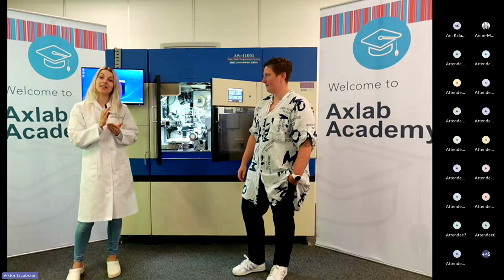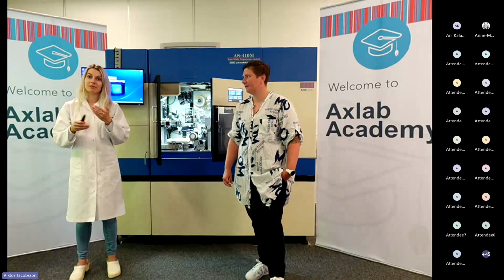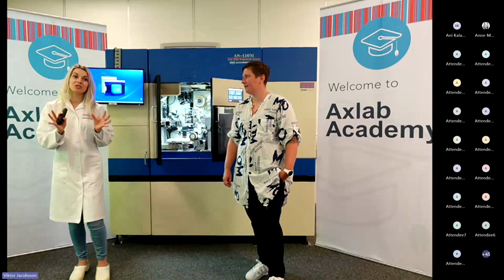Do you know when the system will be allowed to be used in the US? I think that's for you. So I think it actually has been approved to be used in the United States. We just had a customer visiting yesterday, and they're looking into buying this year, by the end of this year or start of next year. The FDA approval is something we have been pending on for a long time, but to my knowledge, it is actually approved, so we could go live in the US, and we're looking forward to it, because that is a market where we think there are some really interesting customers.